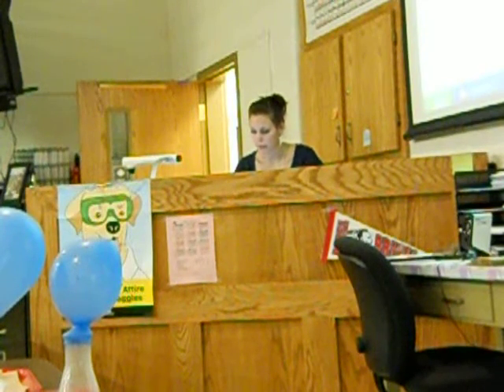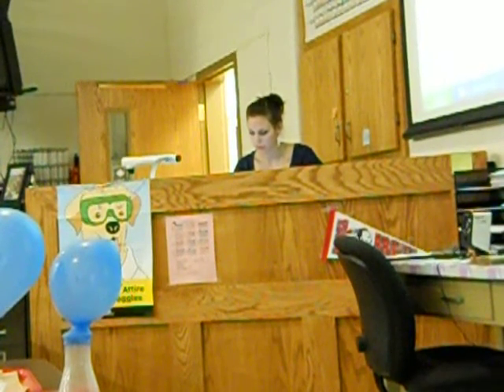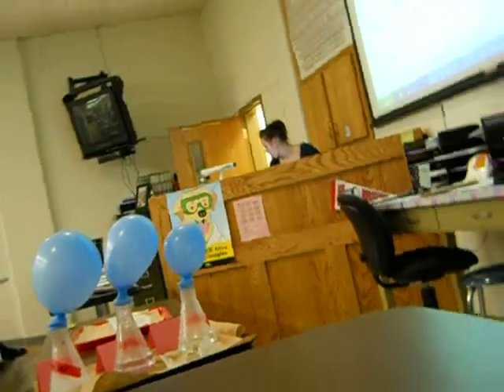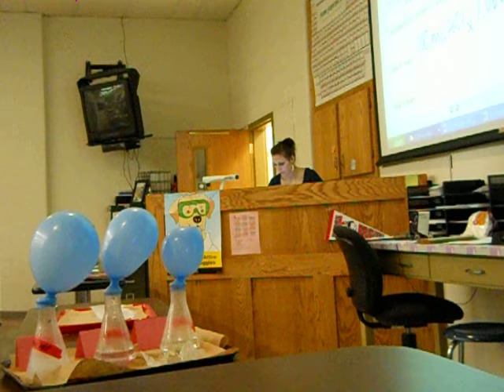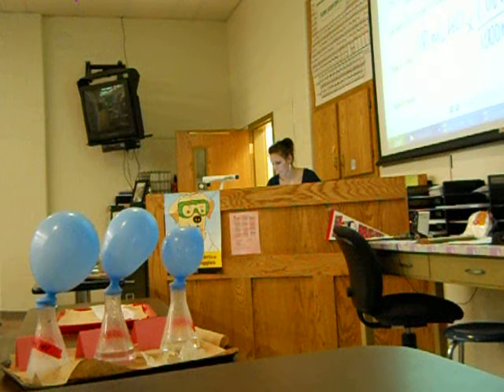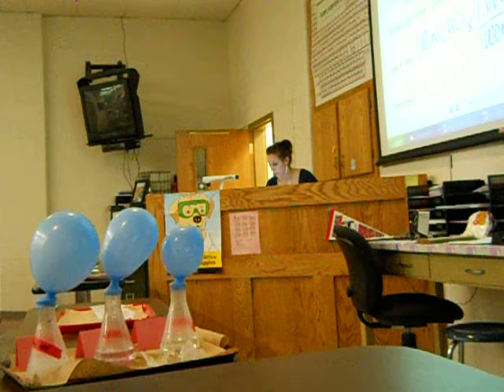So I had 100 mL of HCl, and I'm going to use the second conversion factor. That gives a number of 0.100 moles.